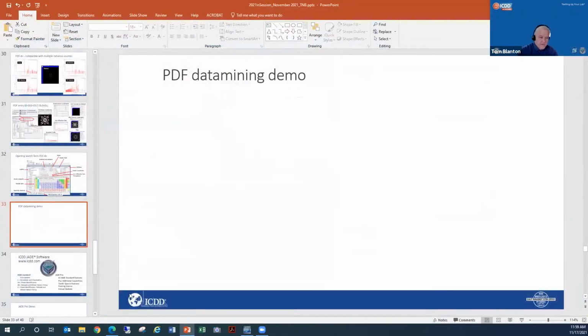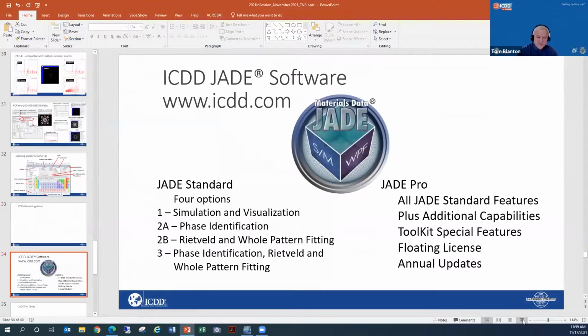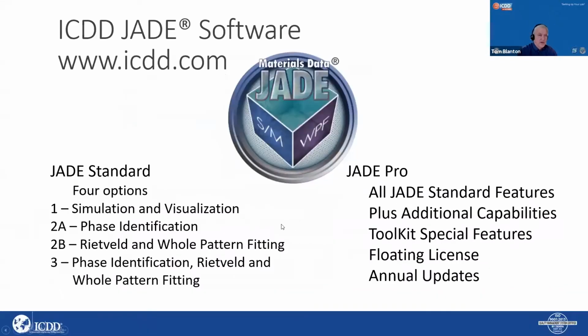All right, so now I'm going to switch just for a second here to the JADE software. You've got the database, now you want to do the analysis. And there are two principal versions. There's JADE Standard and there's JADE Pro.